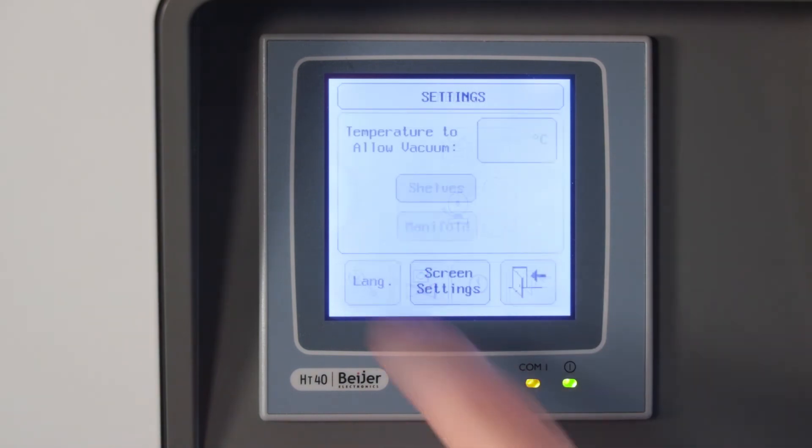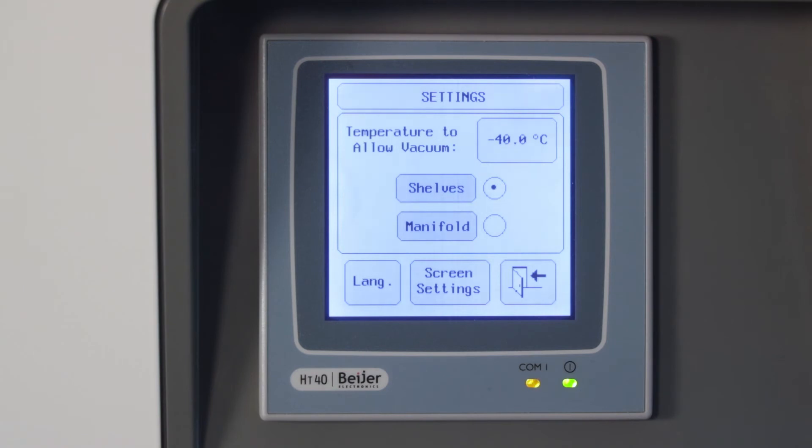Settings screen. You can select the temperature to allow vacuum, shelves, or manifold. You can select language here.